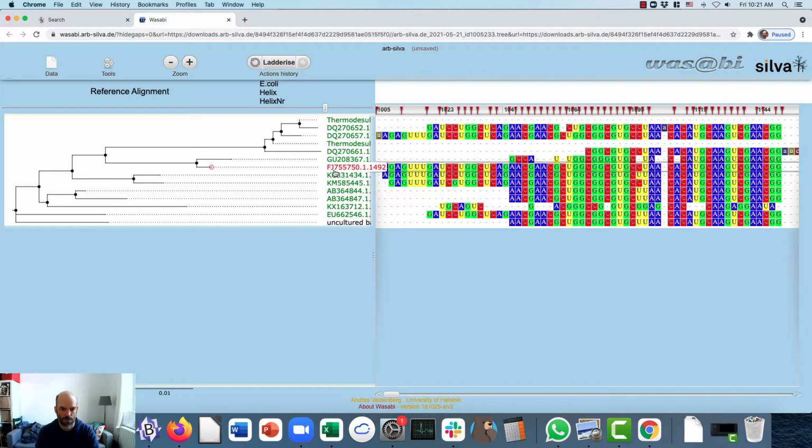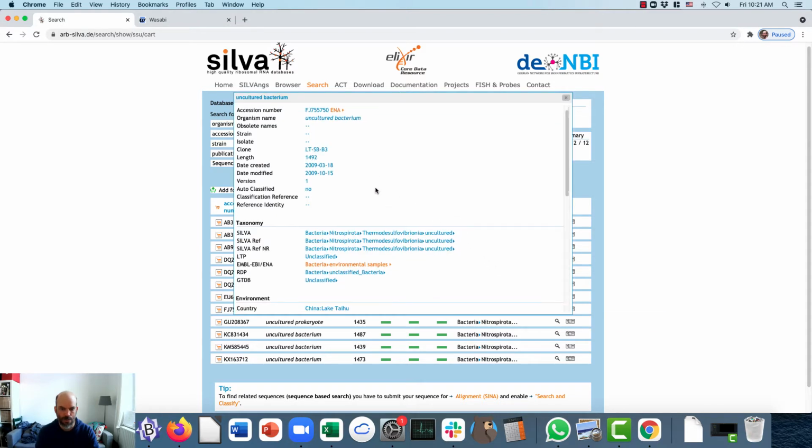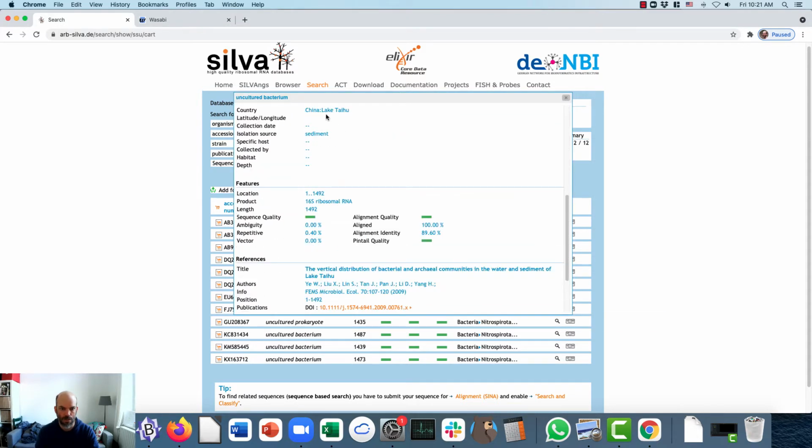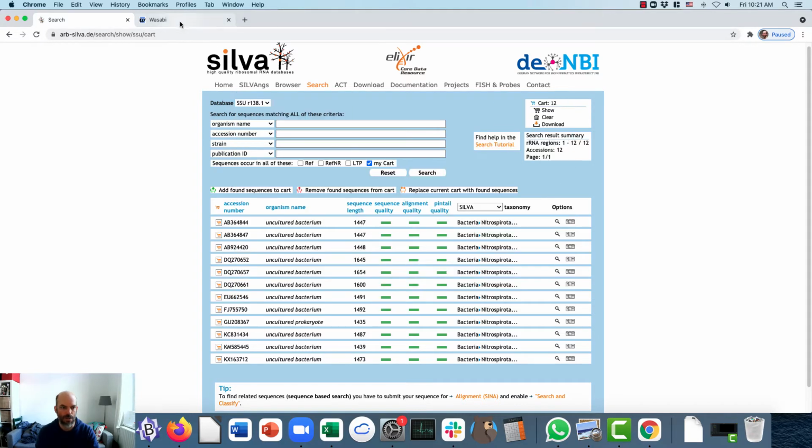And the other one was FJ755, this one also from a lake in China, and we can read more about it potentially in that paper. Okay, so there we go.